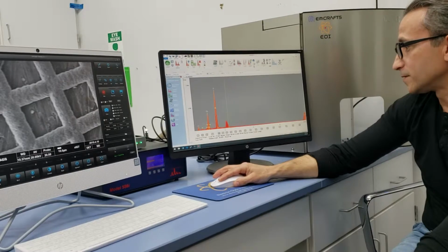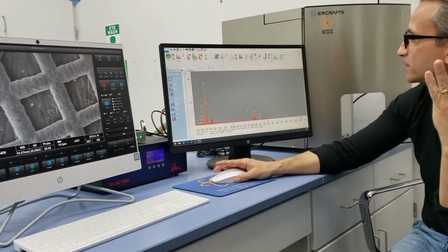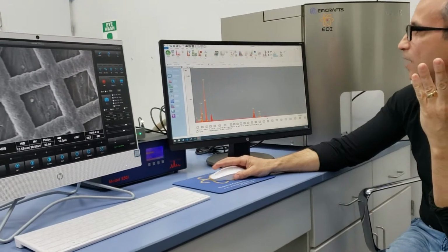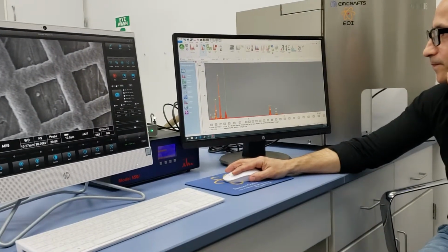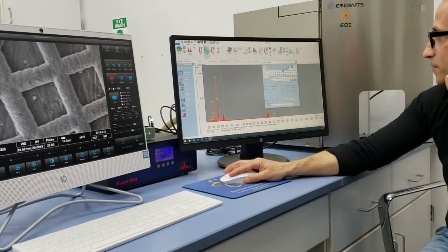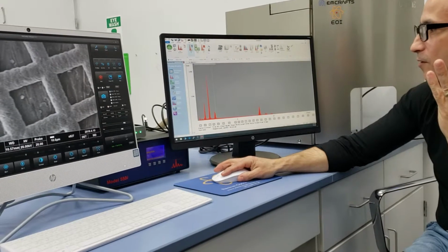So in that regard, there's a fourth way of labeling. You know what? I don't know what the hell is there. You tell me what's there. Question mark. Clear the list, auto ID.